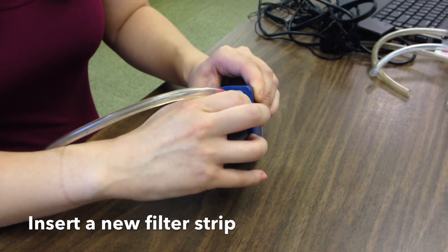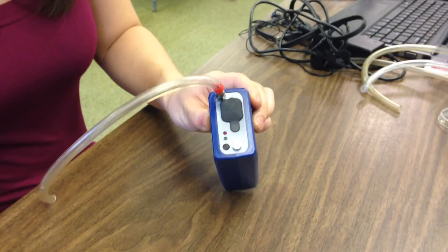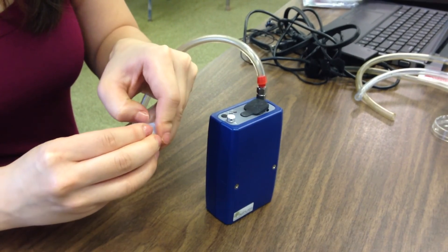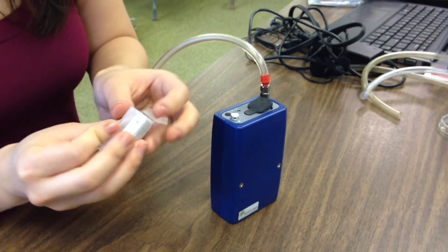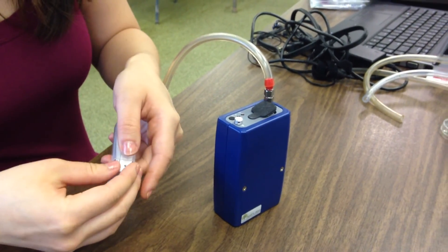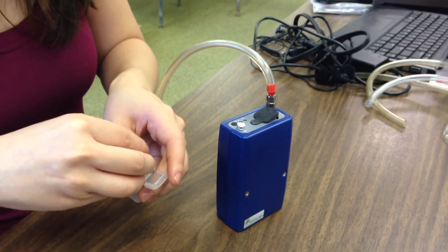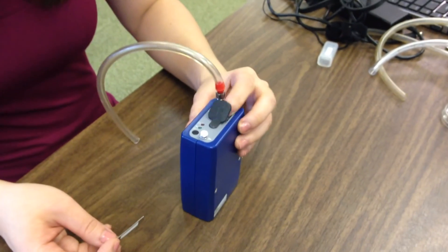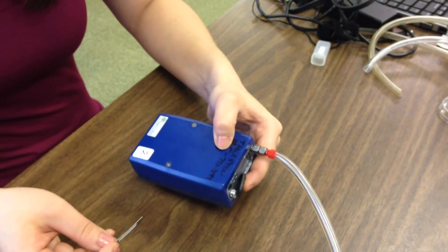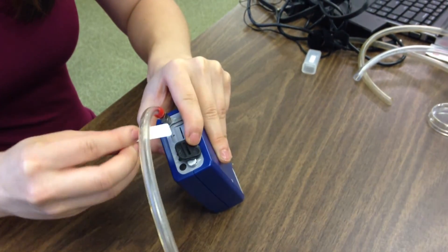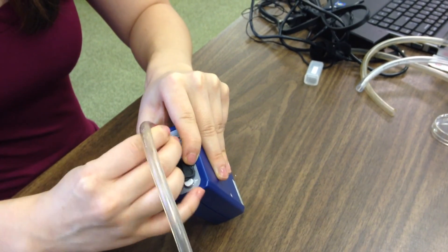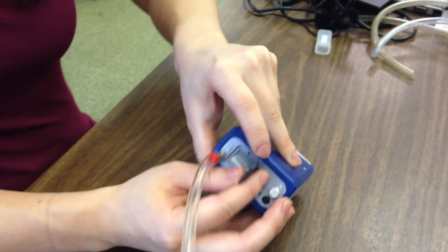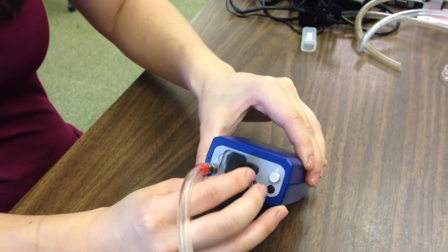Before each run, a new filter strip must be inserted into the ethylometer. Open the black cover at the front panel of the instrument and hold down the filter release button at the bottom while inserting a new filter strip into the slot. The white side of the strip should be facing the top of the ethylometer. Once the strip is securely inserted, place the cover back on.